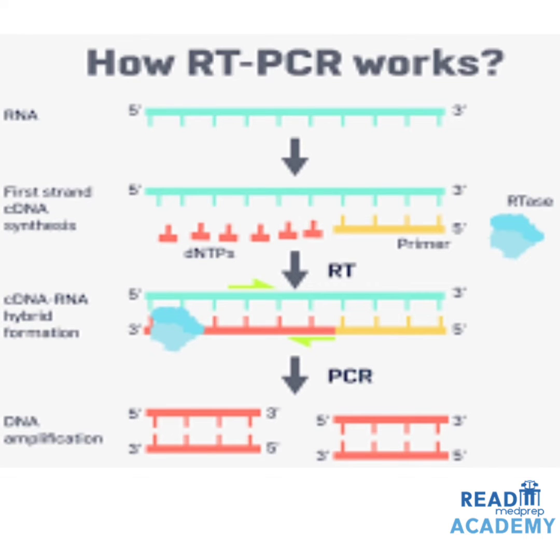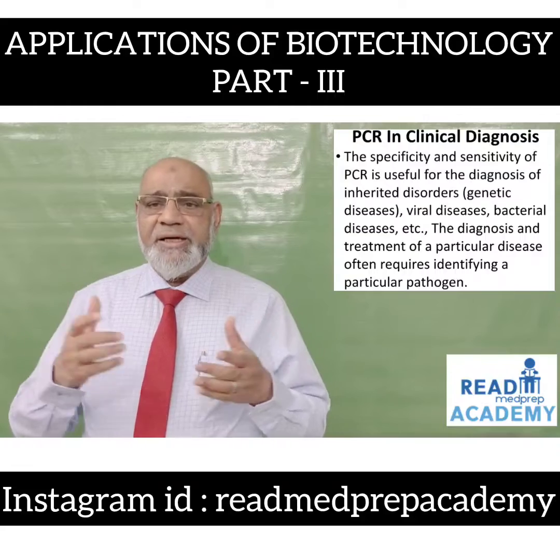How does RT-PCR work? Here the RNA strand is taken and a complementary DNA strand is synthesized by the enzyme reverse transcriptase, and the complementary DNA-RNA hybrid formation occurs and the DNA amplification is done after the complementary DNA is formed. PCR in clinical diagnosis.